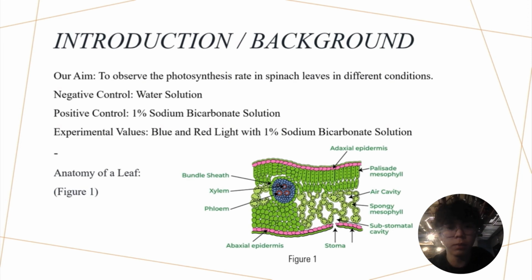During the experiment, if photosynthesis occurs within the leaf, oxygen gas byproducts will return to the spongy mesophyll layer, reopening cavities and causing the leaf to become less dense and float to the top of our test liquid. This experiment effectively visualizes which spinach leaves undergo photosynthesis from the rate of oxygen production.